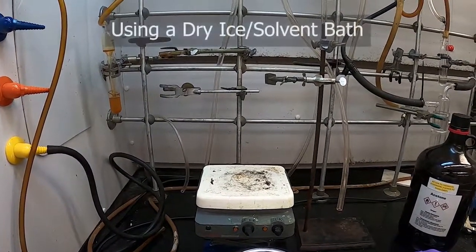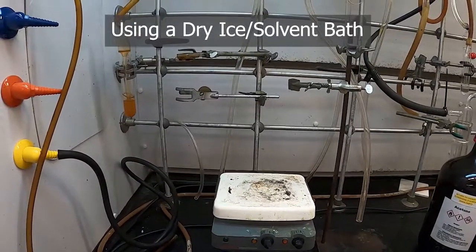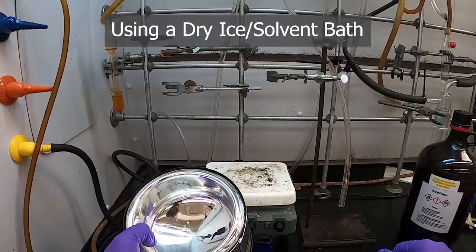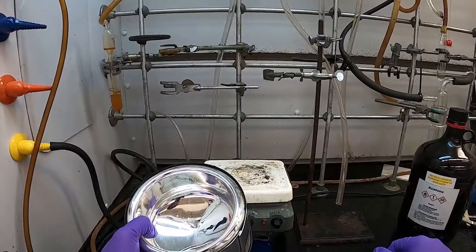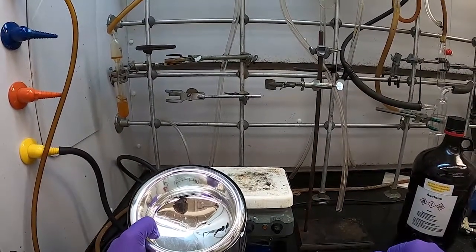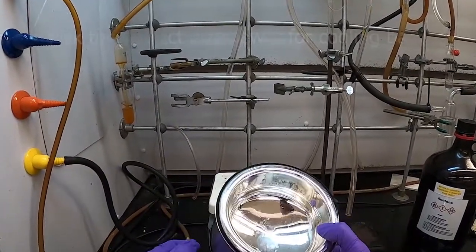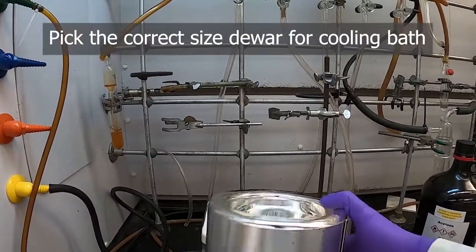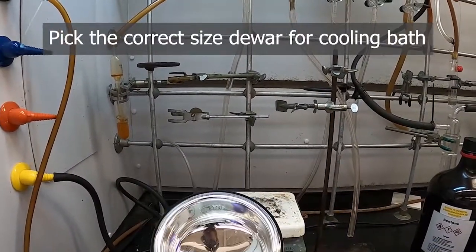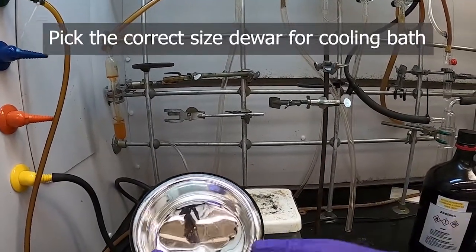A common cooling bath seen in organic chemistry is a dry ice and acetone bath. So that can be made by, of course, just putting dry ice in a bath of acetone. And that will get you about minus 77 or 78 Celsius. So to do that, you need to do it in a dewar. So this is a wide mouth dewar. They come in different sizes. This will be one, of course, for a much smaller reaction flask.